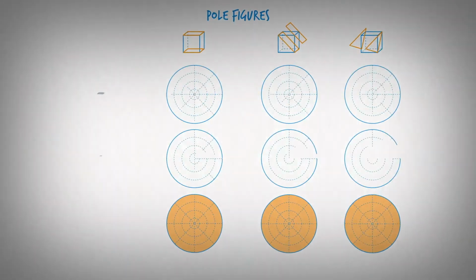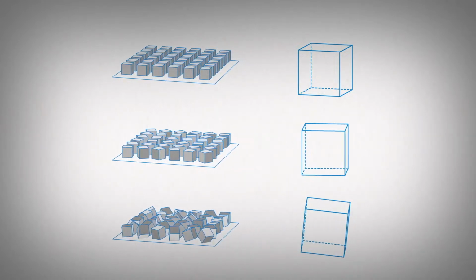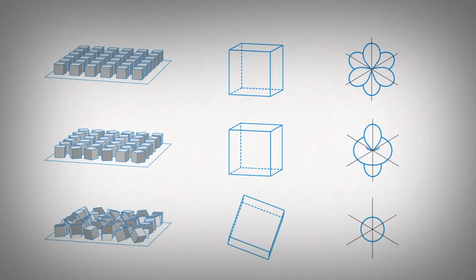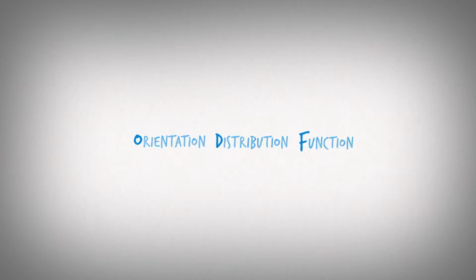In some cases, the pole figures are all that is needed and the job is done. In other cases, a single orientation model which takes into account the three independent pole figures is needed. There are many ways to model the crystalline components of a texture, including modeling an actual physical texture or using a series of mathematical equations. The end result is a single sample model which explains the measured pole figures. This sample model is called the Orientation Distribution Function, or ODF.